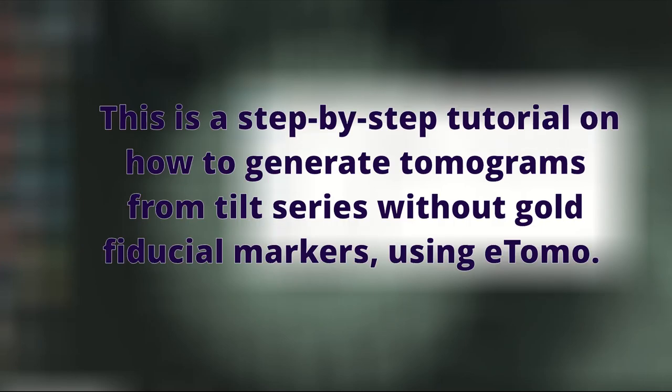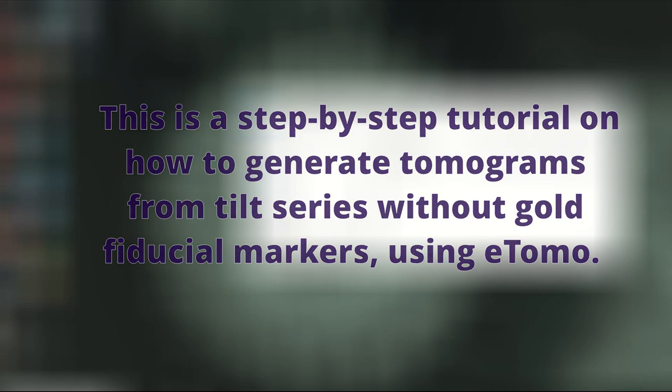So this is a tutorial on how to generate tomograms from tilt series that do not have fiducial markers, so do not have gold fiducials. This tutorial uses eTomo which is part of the iMod software suite.